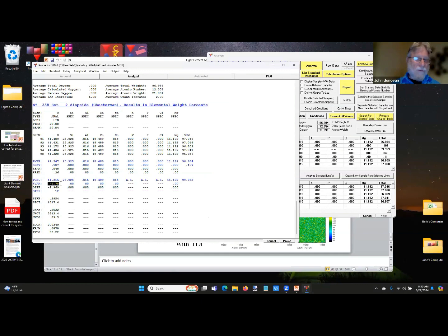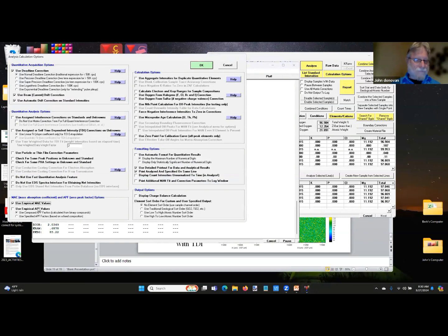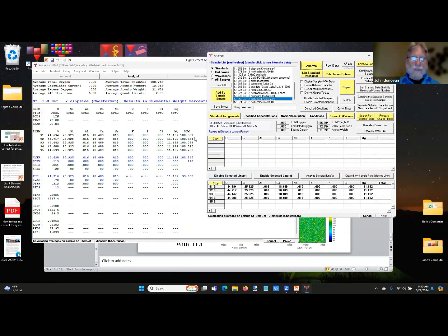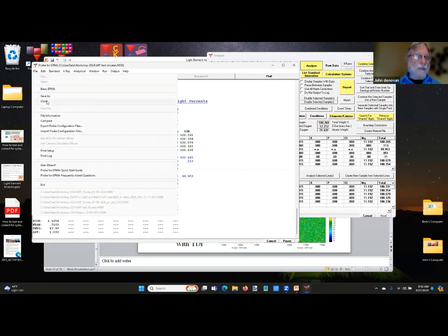And we're off low by about 6%. We're getting almost 7% relative error, and we're getting about 97% total. We turn on the corrections and we analyze diopside, and now we get 100.265% total. We're within 0.7%. This is an actual measurement, just measuring oxygen. You could, of course, analyze the other elements too, but I was lazy. But it does work amazingly well, actually.